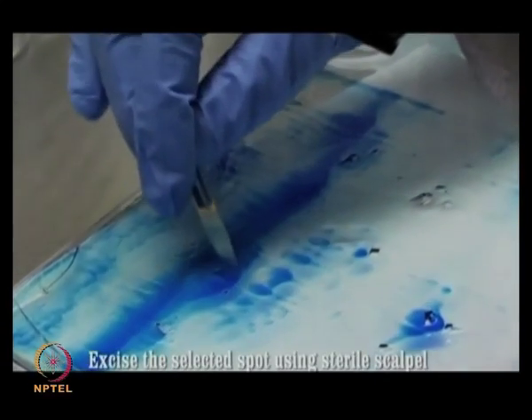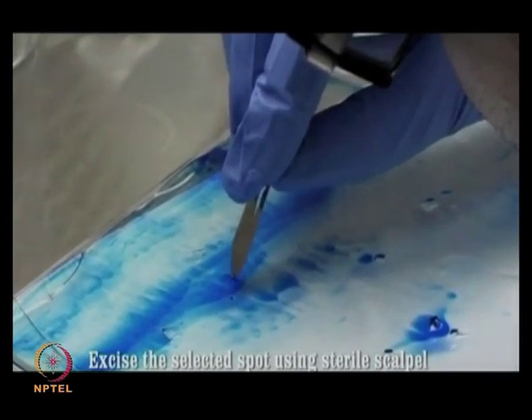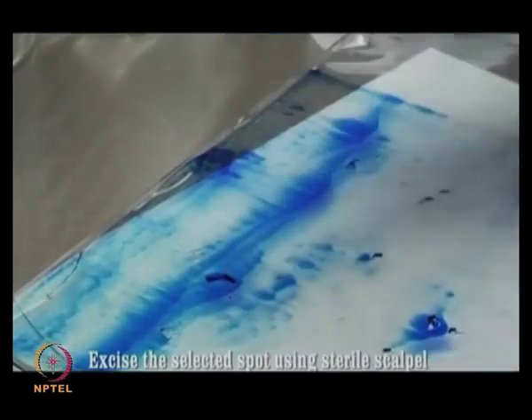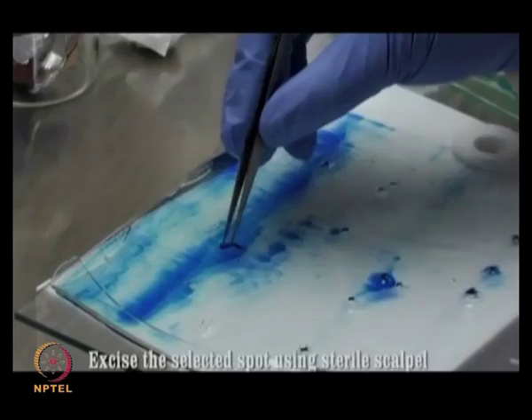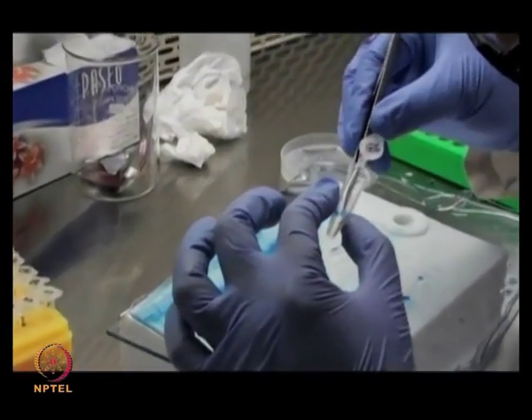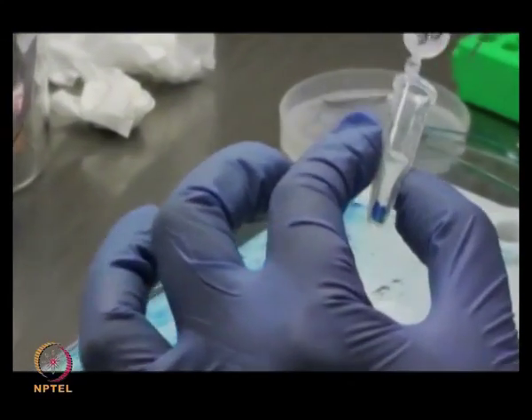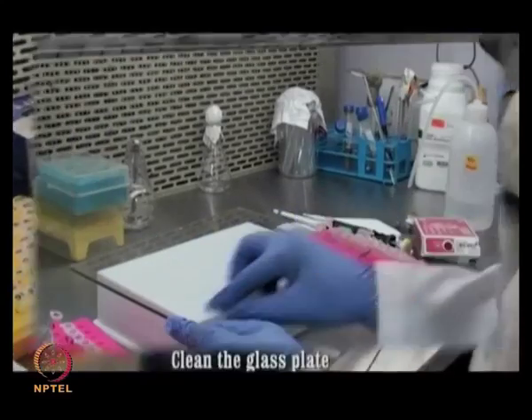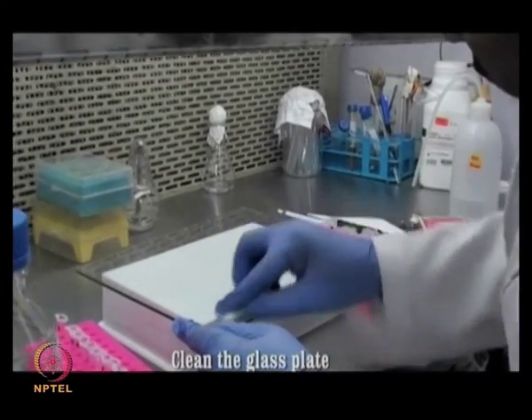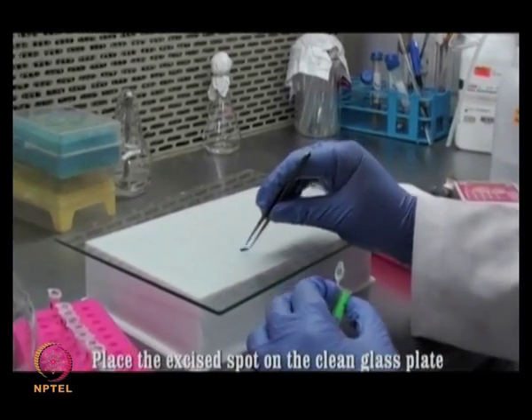Excise the protein spot with a clean sterile scalpel and place the gel slice into an Eppendorf tube. If you have excised a large spot or large band, then cut the slice into cubes while avoiding too small pieces as they can clog the pipette tips.